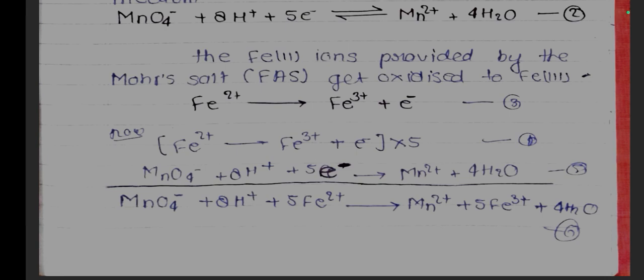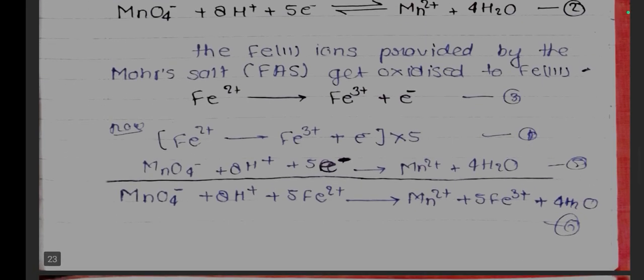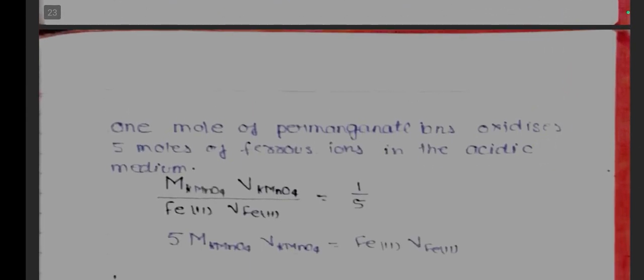Permanganometry, what is permanganometry? It is found using potassium permanganate, KMnO4, which is also called the self indicator. In this experiment you also have to use the self indicator, KMnO4, and in this experiment KMnO4 is filled in the burette.